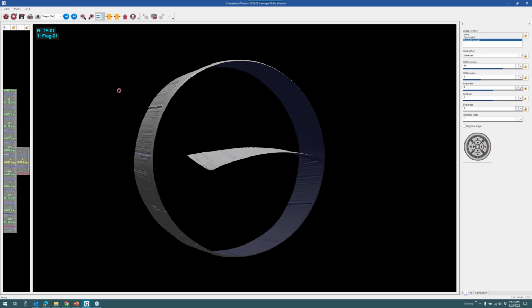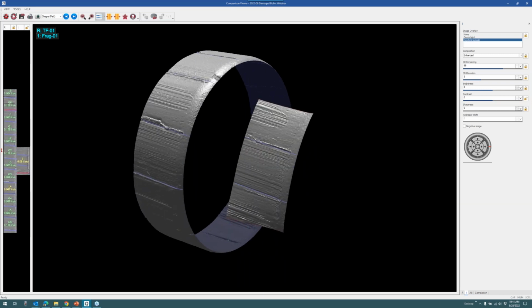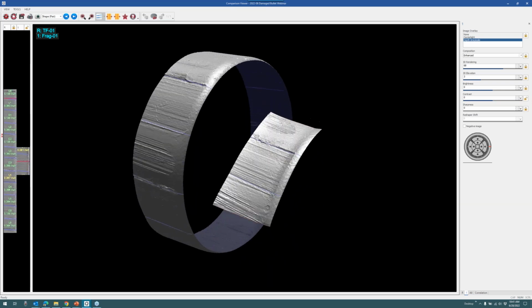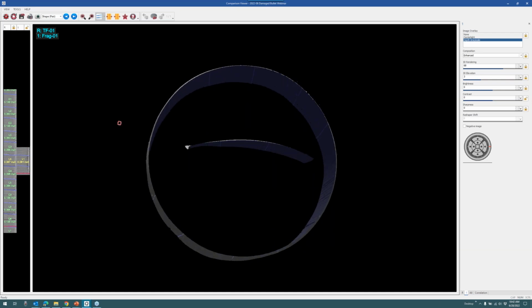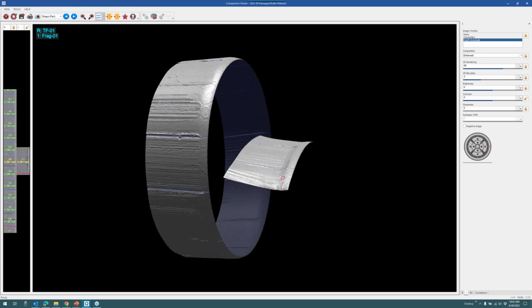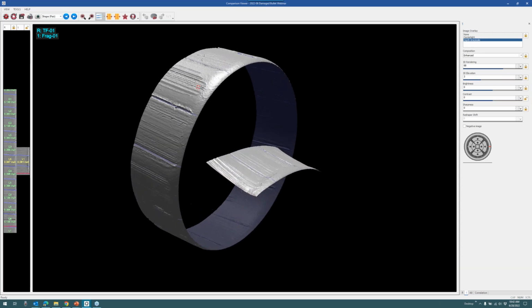its original cylindrical shape, which is what you'd expect with a test fire. However, fragment 1 is almost flattened out. There's a bit of curvature still to it, a bit of a twist as well to that metal. But we can see each of these with their original shapes here.